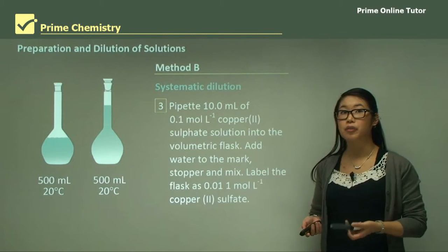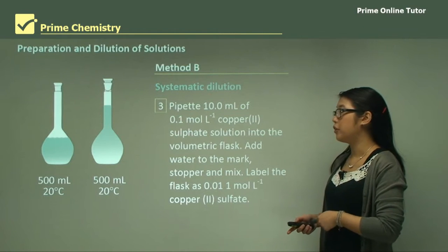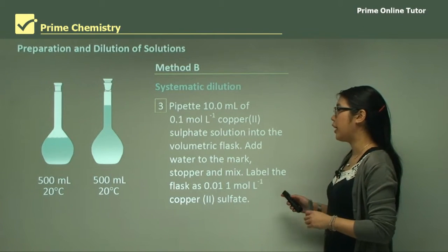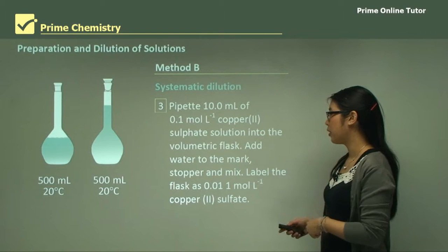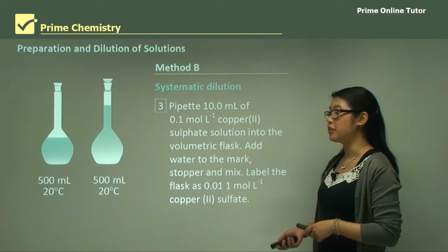We pipette 10 mL of the first solution — the 0.1 molar one — and add it to the 100 mL volumetric flask that we just cleaned. Then we add water to the mark, put the stopper in, and shake it to make sure it's mixed up properly. We then label it as the 0.01 molar copper sulfate solution.